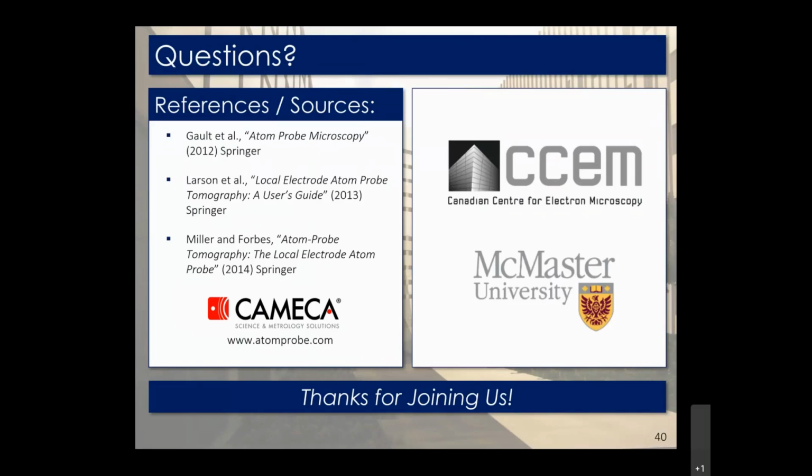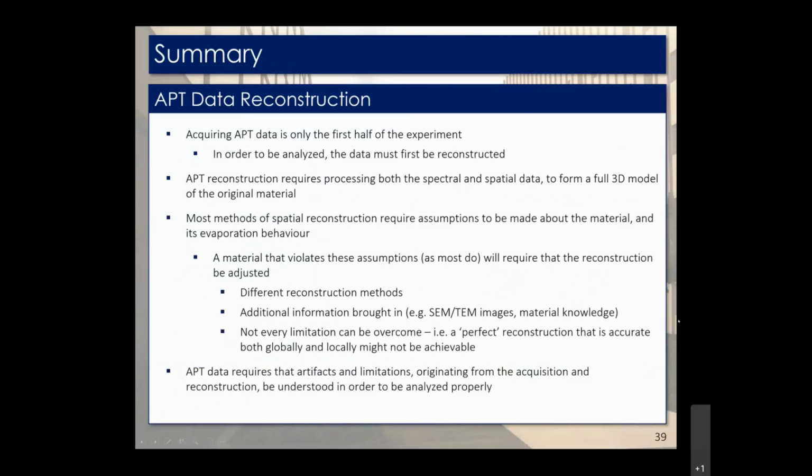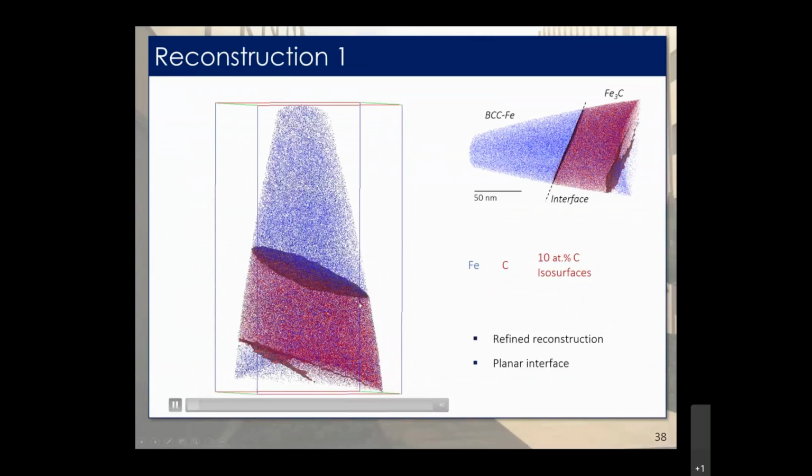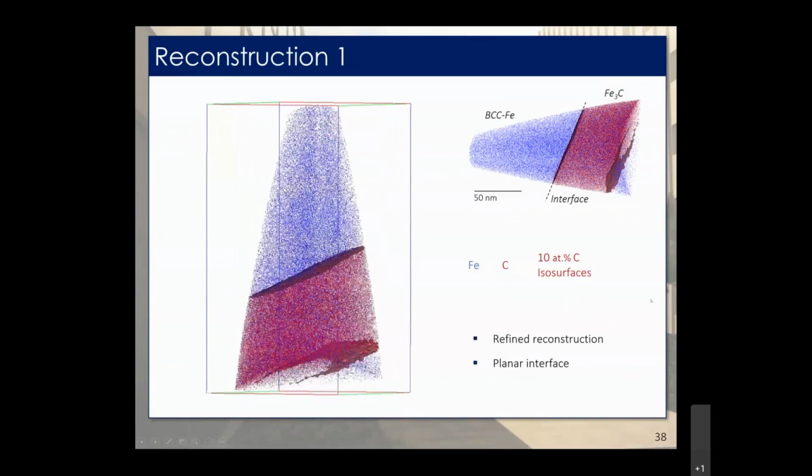Great, thanks, Brian. So, all right. Your sample worked well with 2 stacked phases. How would the correct procedure vary if the phases were next to each other? So I guess the idea would be if the 2 phases were side by side. If I could just go back a couple slides, so instead of this sample where I have basically one on top of the other, versus if it was side by side, how that would vary.